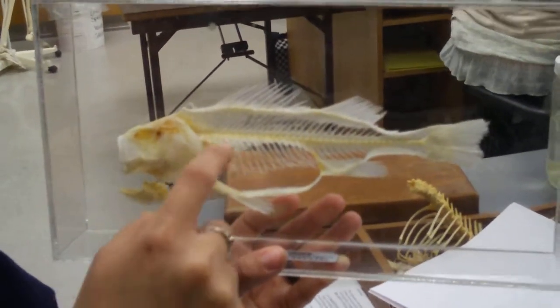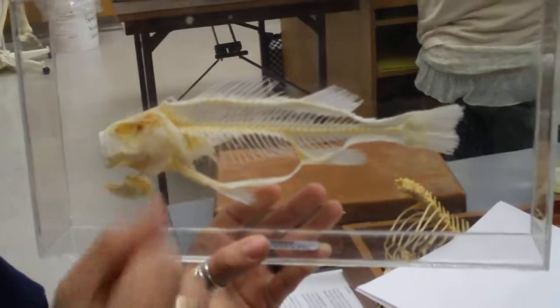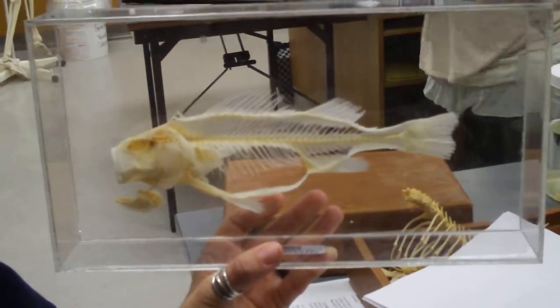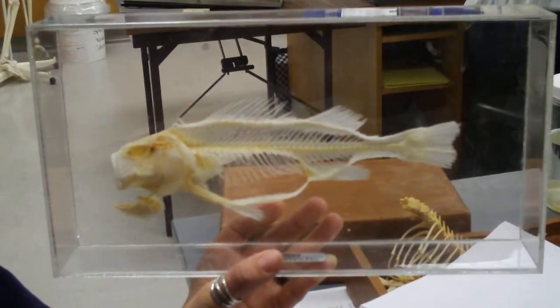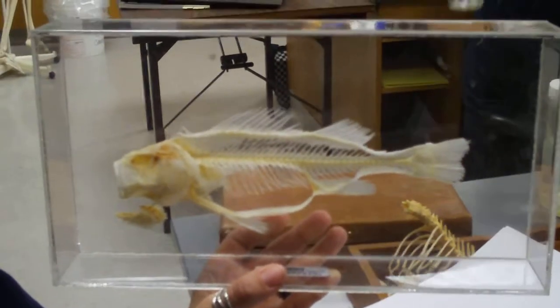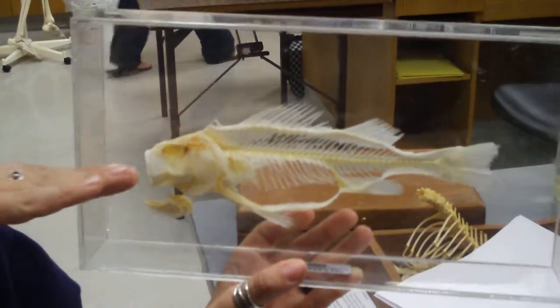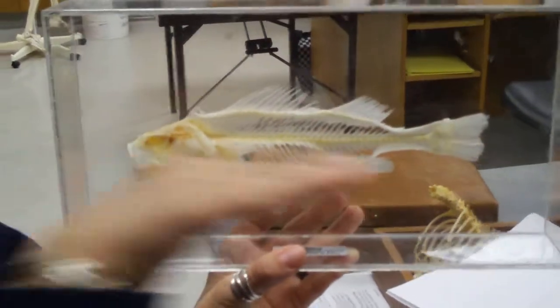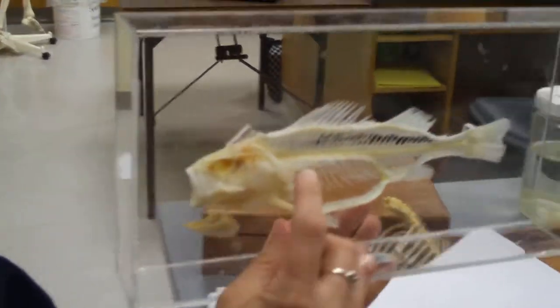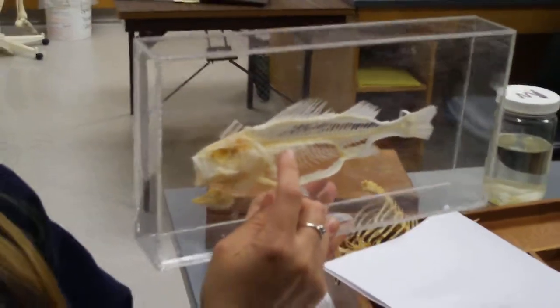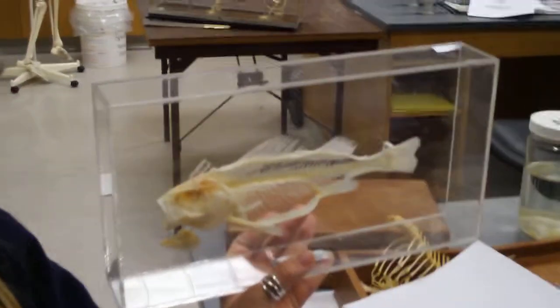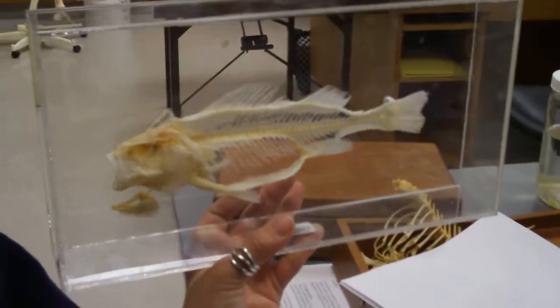And then you can see how there's ribs going down. The long ones, those are your pleural ribs or ventral ribs. Then you have like these little tiny thin ones that are kind of going more this way with the fish. Can you see those little tiny thin ones? Everybody see those? Those are your dorsal ribs or your epipleural ribs.